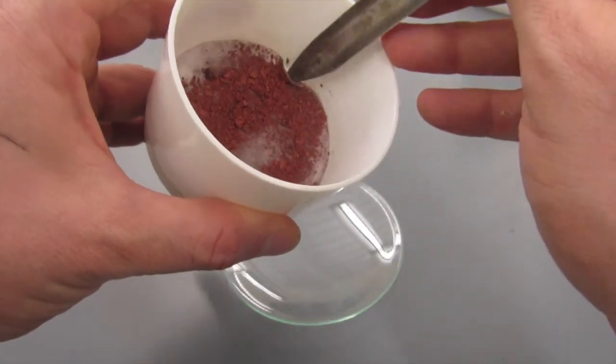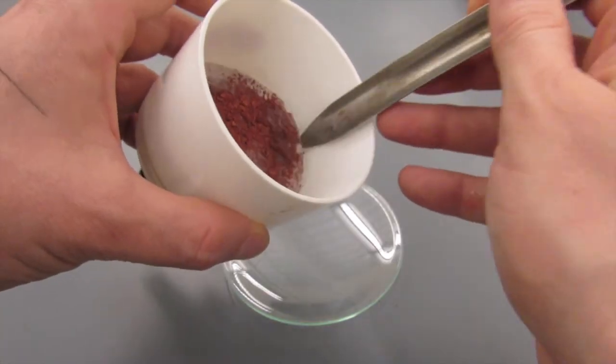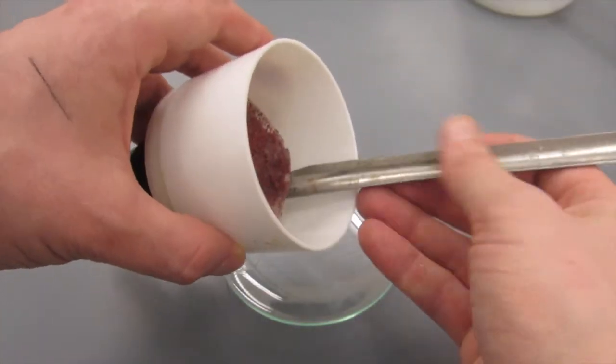I used a scoopula to help me get the filter paper out of the Buechner funnel. I then placed it on a watch plate so I could dry it overnight.